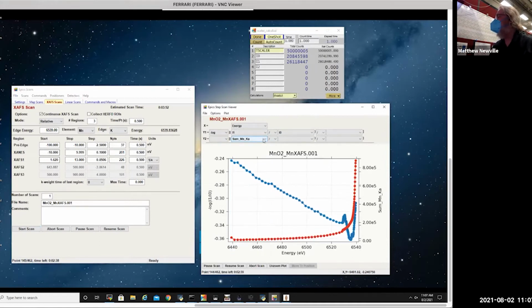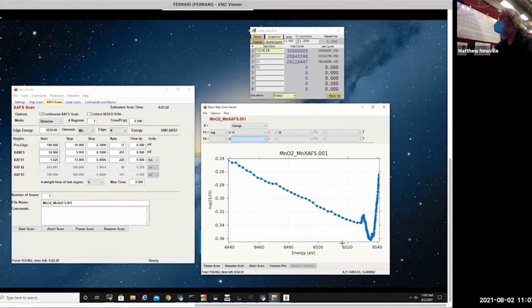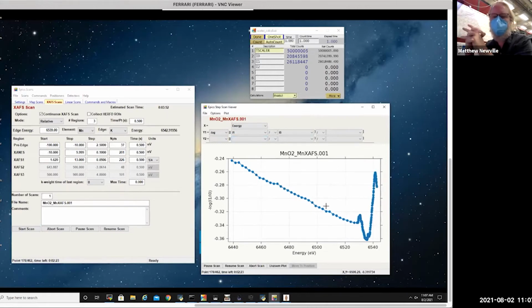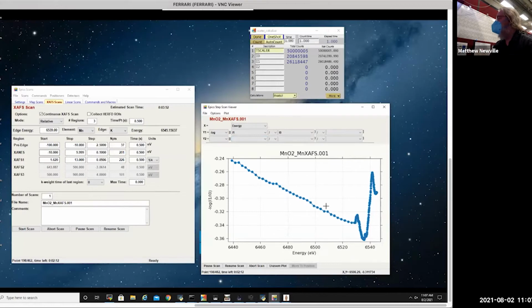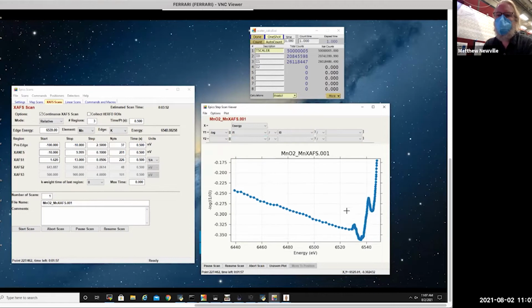So again, we're looking at this in fluorescence in red, and it's going up. And actually, we see this thing that is rarely talked about and is not uncommon, and that is there's a little dip at the pre-edge peaks in many samples that are not perfectly formed, and for beamlines that have a slight amount of harmonics. We shouldn't have very many harmonics at 6 keV, but. So this is for MnO2, for pyrolusite. There's a little bit of a pre-edge peak. These are the pre-edge peaks, and now we're going up to the main edge. Again, for all of these samples.